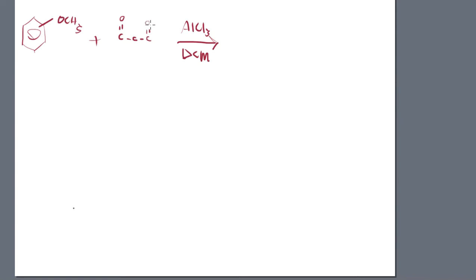But folks, that's okay, because anhydride is also an acyl containing group. It has a C double bond O group, and that's really what aluminum trichloride and the acylation is going to focus on. So we get this anhydride group, and that's an oxygen that's there in between the two carbons, and that is the anhydride. And acetic is this idea that we have two carbons. We learned that from the carbonyl lectures. So here's my first carbon already included in the carbonyl, and there's my second carbon. And it's just acetic anhydride.